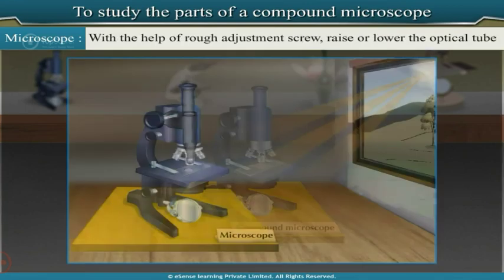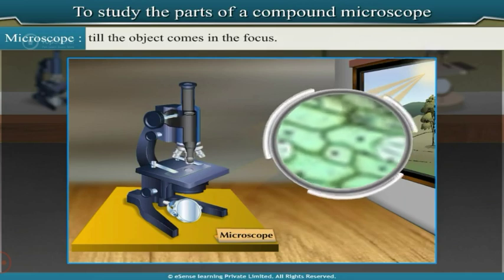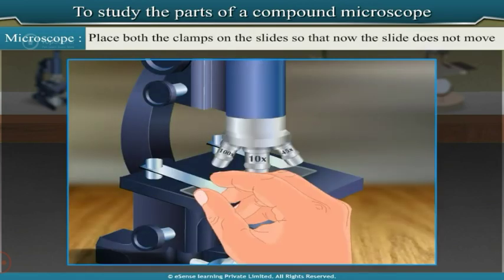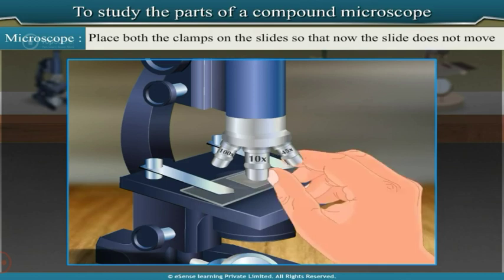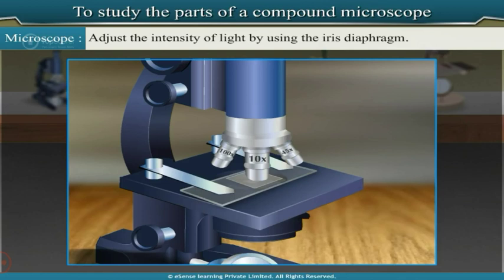With the rough adjustment screw, raise or lower the optical tube until the object comes into focus. Place both clamps on the slide so it does not move from your required focus. Adjust the intensity of light using the iris diaphragm.